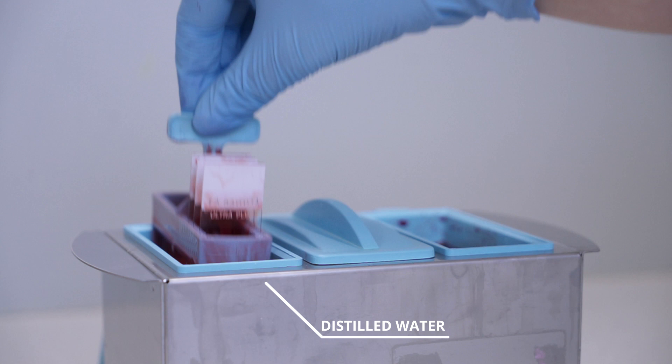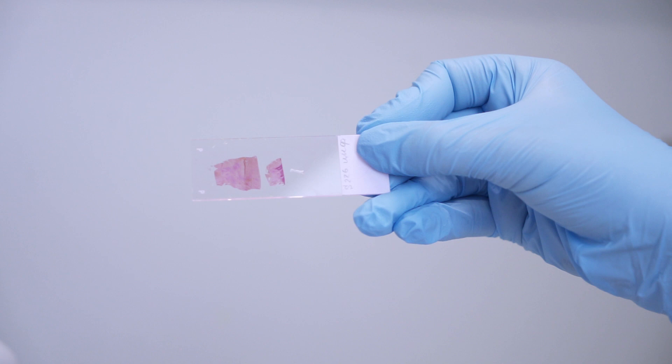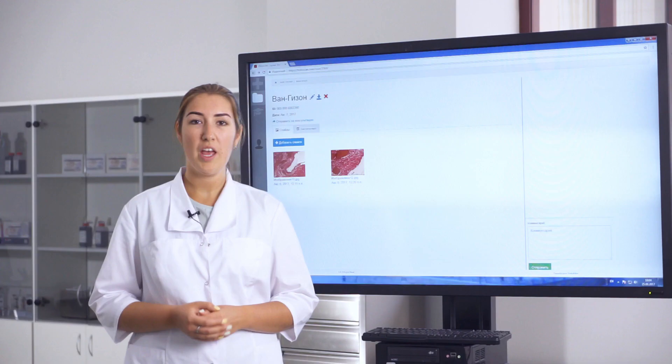Then we wash the slides quickly in distilled water, then dehydrate them in alcohol, clear, and coverslip. After that, the slides can be studied under the microscope.